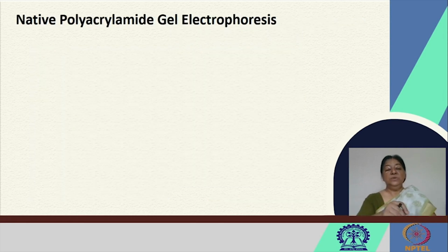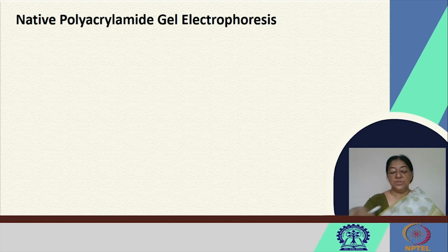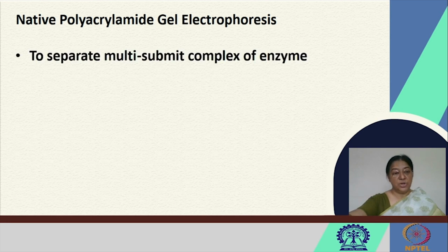Now, when we use SDS for this particular experiment in SDS PAGE, there is one thing that we need to be concerned about: SDS denatures proteins. So if we have a multi-subunit protein, these subunits will disintegrate into their relative monomeric units. Now, this disruption is going to be a cause for concern if we do not know our actual protein multi-subunit structure.